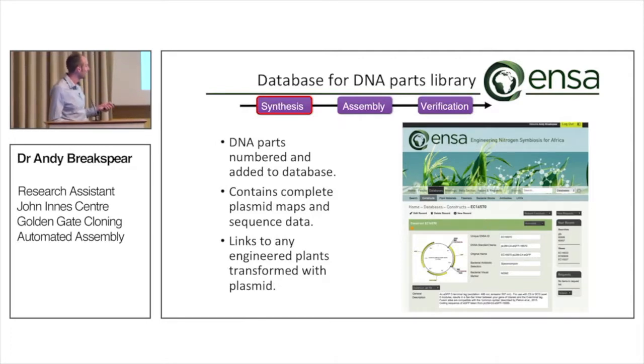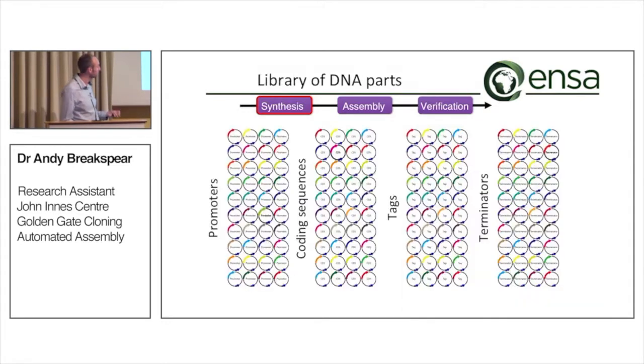And then, as I said earlier, for every plasmid that's being transferred into a plant, it has a link to those plants, and you can see how that particular plasmid has performed in that plant. So, I mean, we are in the early stages, but we're starting to build up an idea of what works well and what doesn't.